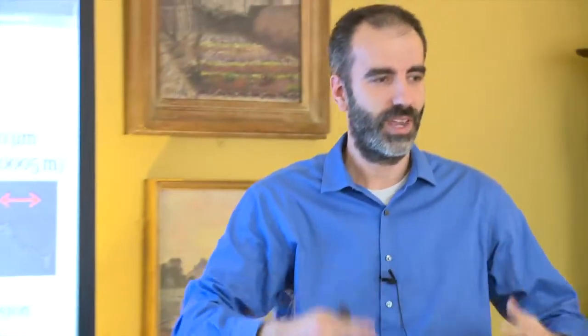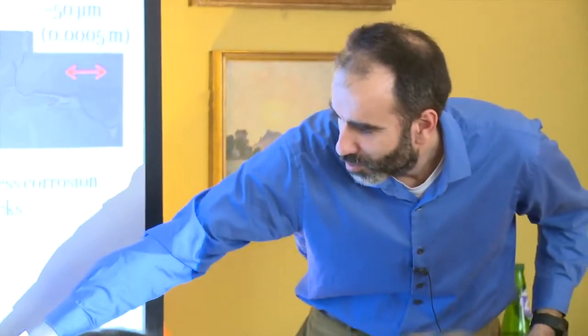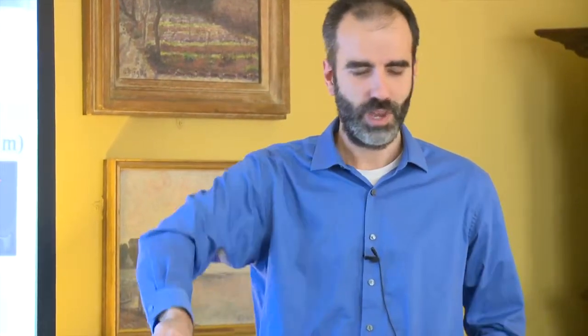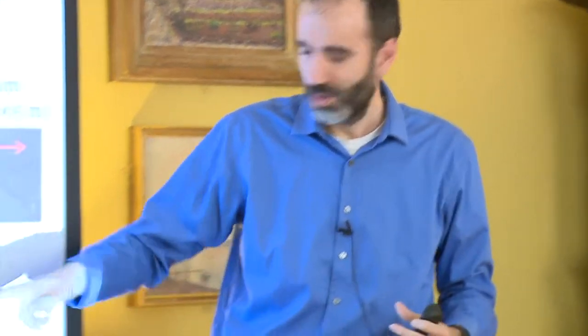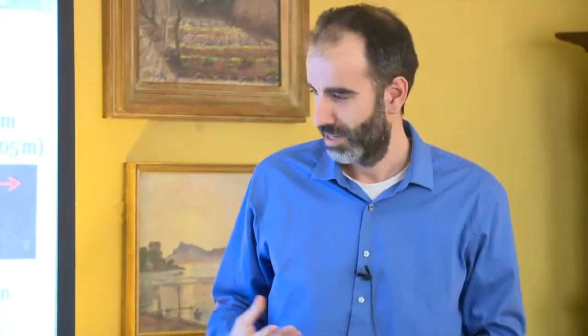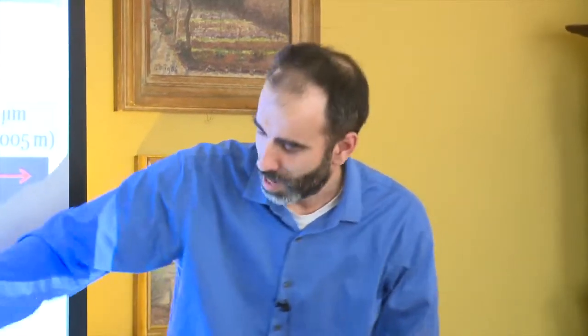If you look ahead of this region and you increase the magnification even more, this was, I think, at quite a 20 million times magnification. Imagine in the electron microscope we have a knob where we can go higher and higher in magnification. You need to go to 20 million times to be able to see atoms, right? And this is what we find in any metal. In our case, we want to see how these atoms move before the crack propagates.